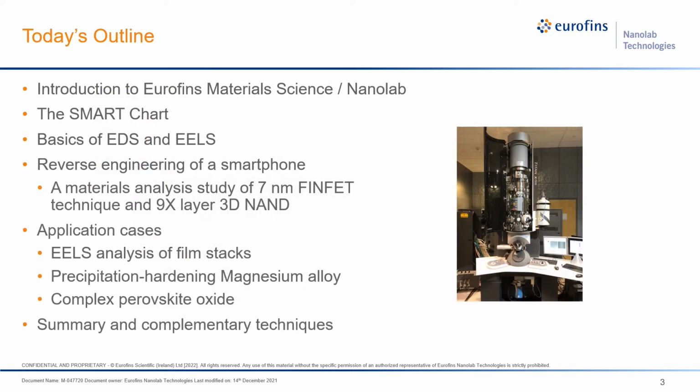So today's outline. First, I will give an introduction to our company, Eurofins Material Science and Nanolab Technologies. Then I will give an introduction to the Smart Chart, a summary of technical services we provide at Eurofins Material Science. Then I will jump into the main topic, starting with the basics and fundamentals of EDS and EELS. Then I will discuss a series of application case studies, including a reverse engineering materials analysis study of 7nm FinFET and 3D NAND technologies, and then some STEM studies on some other materials.